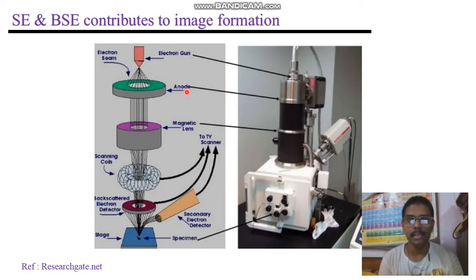Now after that, electrons pass through the vacuum present inside the microscope. Now as there is a vacuum inside the microscope, you can't use light, you can't use a glass lens like light to make a well-mannered beam. That's why people use, as in transmission electron microscopy, a magnetic lens or electromagnet to focus all the beams.